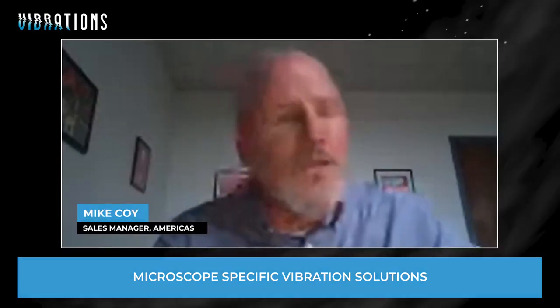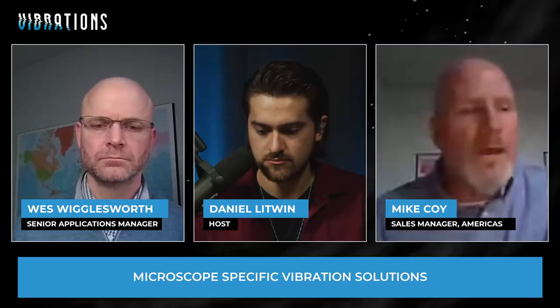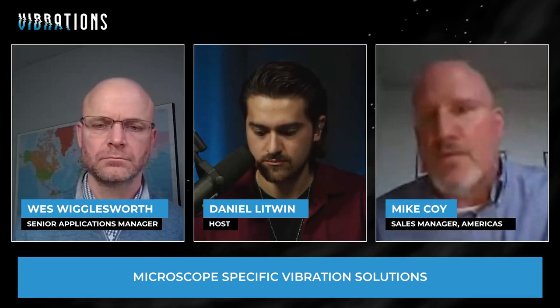Sure. That's a great question, Daniel. Pretty much with an electron microscope, all of the manufacturers are going to go in and do what we call a site survey before an instrument is purchased. They all understand very well that the performance of these modern microscopes really needs an ultra stable and ultra clean environment. So before they ever even think about installing an instrument, a site survey will be done.